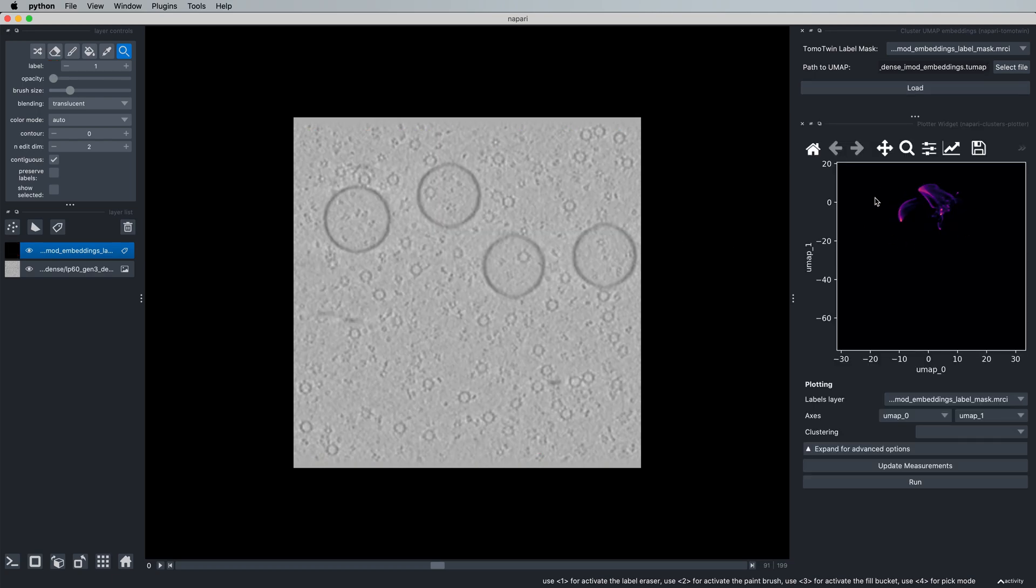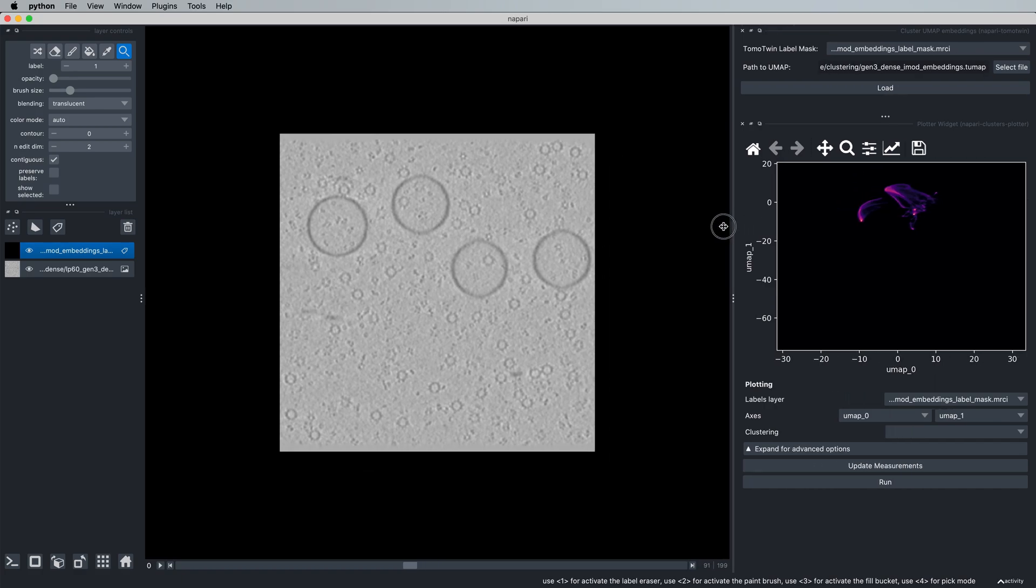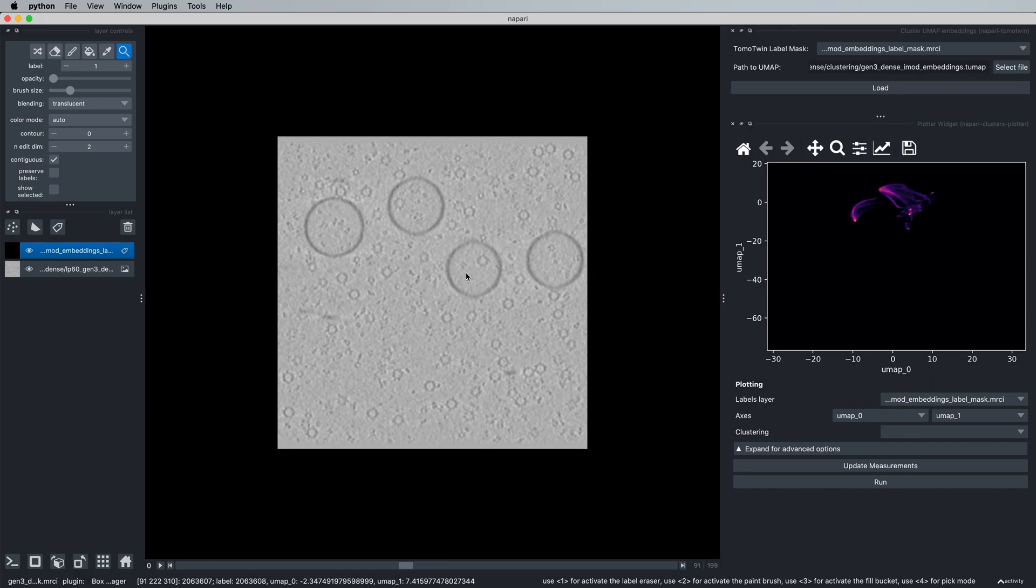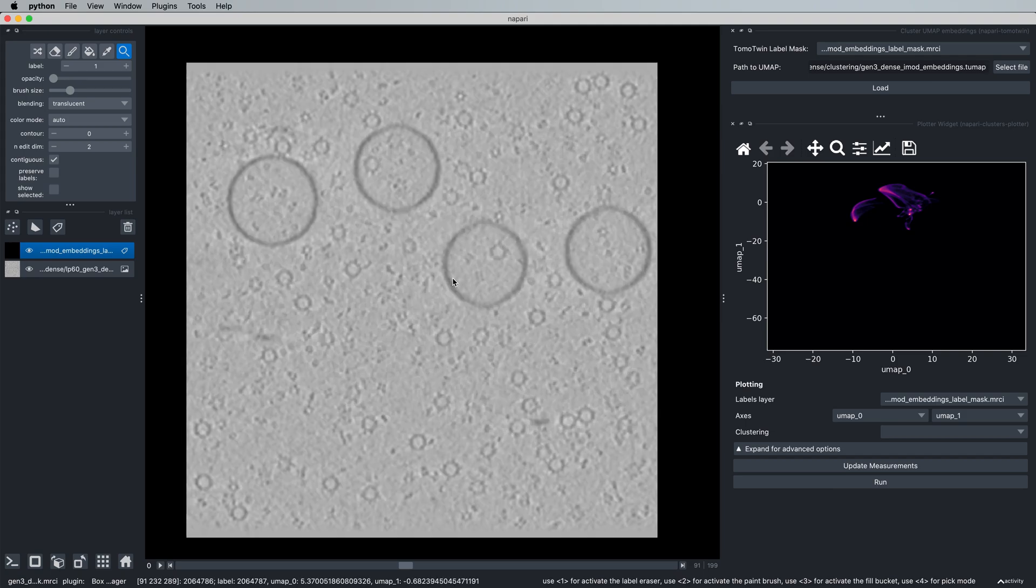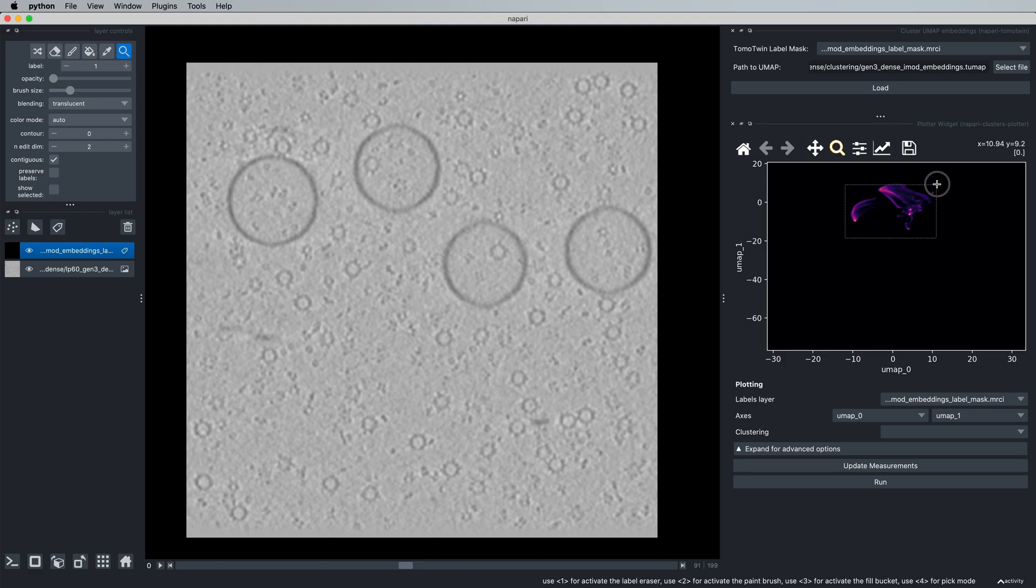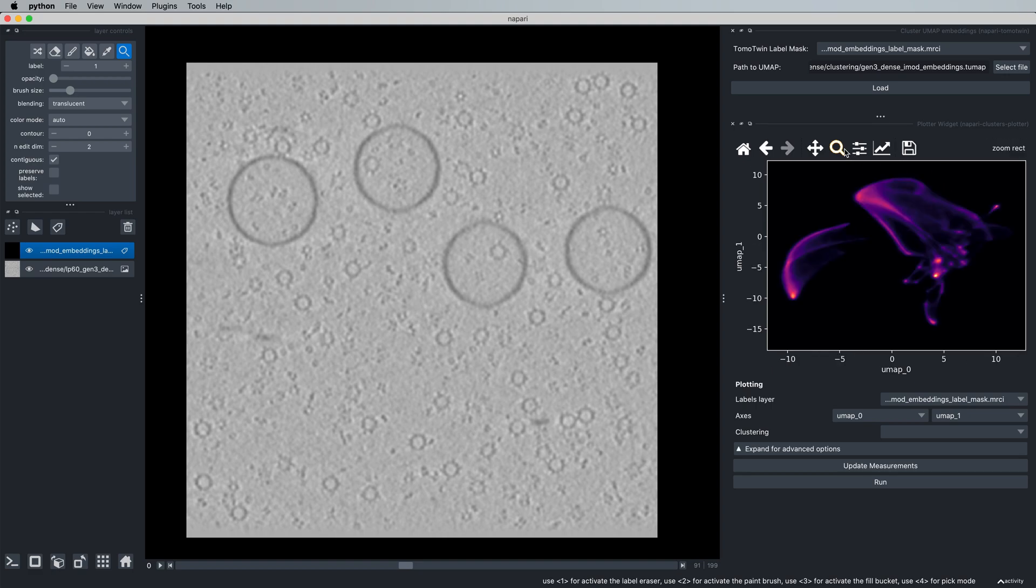This opens this panel on the right with a histogram containing our embeddings. From here, we can drag this window to make it bigger, and you can always zoom in the tomogram using the mouse wheel. If you come up to this magnifying glass tool, you can draw a zoom box to have these embeddings fill this panel.